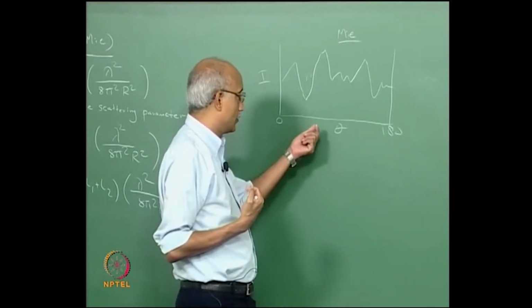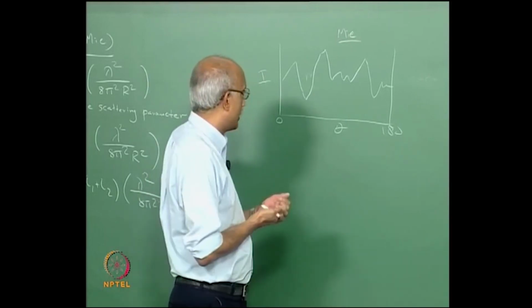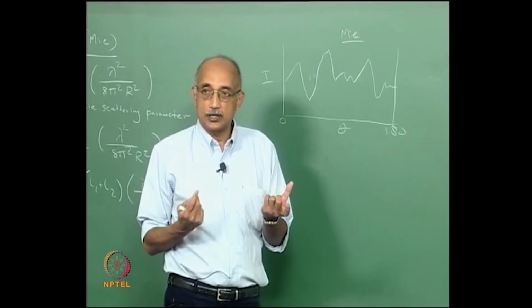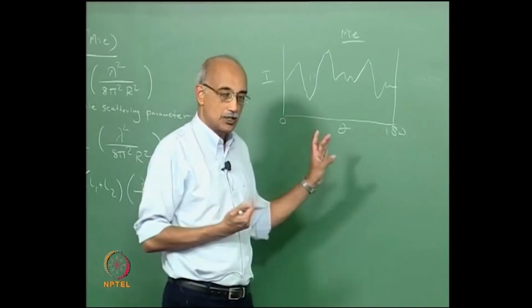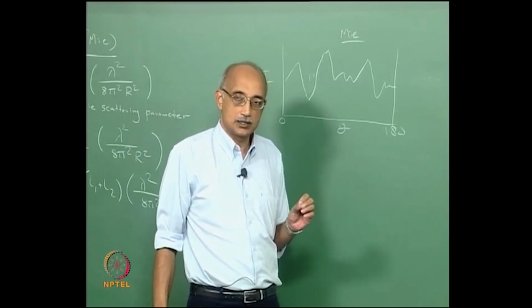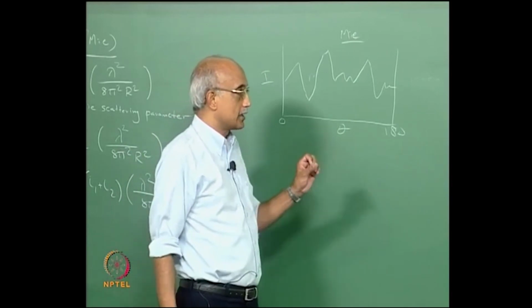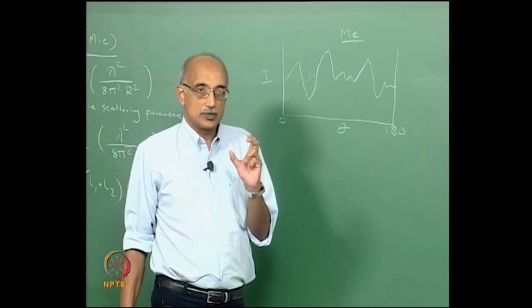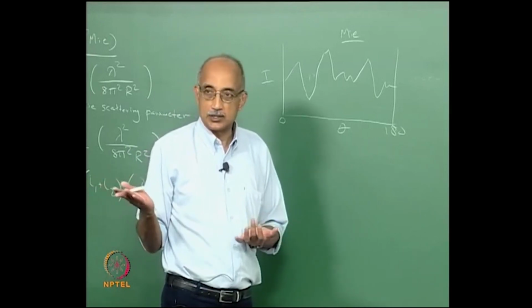So, when you think about it, how do you even use this signal to predict size? Because what this would tell me is for the same particle size you can have multiple intensity values, and for the same intensity value there could be multiple particle sizes that contribute to that intensity value. So, the interpretation of the scattering spectrum in the Mie regime to calculate particle size becomes somewhat questionable. So, for particles that are roughly in the 1 to half a micron range, the uncertainty in the measurement is very high. For particles that are larger, again you can go back to optical methods of analysis.